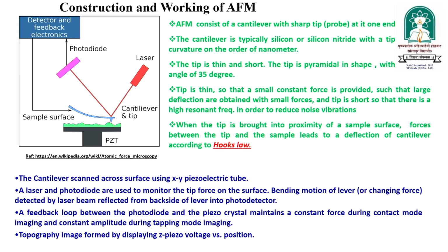In the atomic force microscopy technique, various types of forces are measured. These forces are the mechanical contact force, van der Waals forces, capillary forces, electrostatic forces, and magnetic forces also.